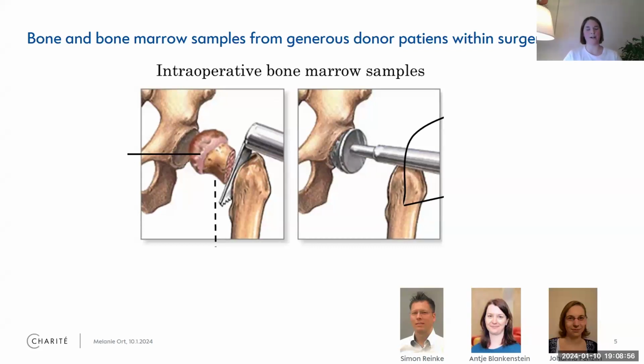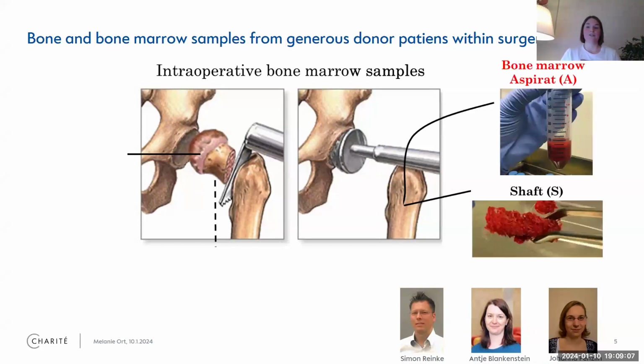So we have a team that actually organizes all of that and provides us with primary samples, which they also quality check. The most interesting tissue for us, or the most cell-rich tissue or liquid in this case, is the so-called bone marrow aspirate. So some of you might know it's the liquid part of the bone marrow. It's usually also used in transplantation.